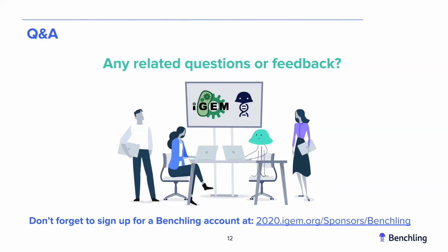Okay. Yeah, Madeline, do you want to field it? I can also field it. Yeah, that's a great question, and we will try to focus on the CRISPR tool more in depth in our molecular biology webinar. We kind of glazed over it today just because we don't have enough time, but you can design single guide RNAs.